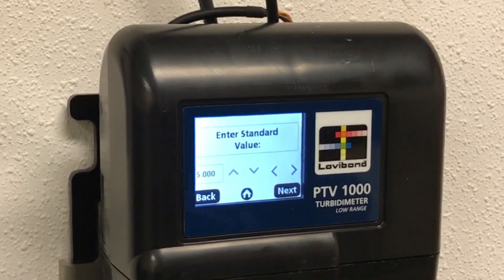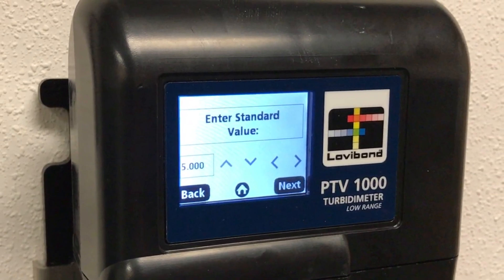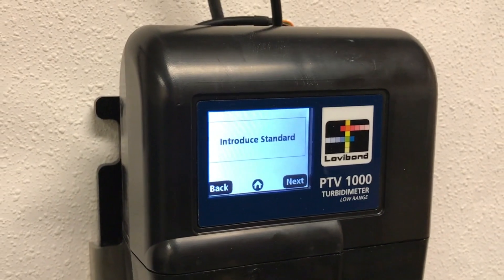The PTV prompts the entry of the standard value. In this case, the value is 5 NTU. Once you select the value, the standard can be introduced.